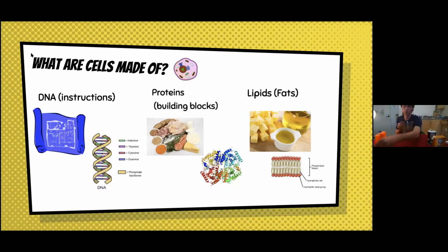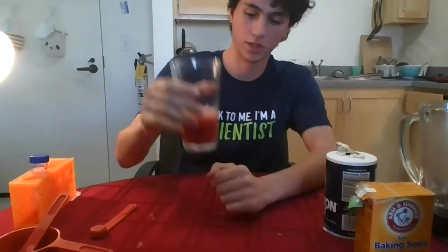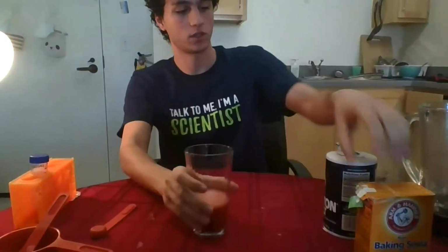So now I'm going to show you how it's supposed to look. Let's see, maybe we can stop sharing. Yep, perfect. So I think you can all see me. And here is, obviously, this looks very much like a strawberry smoothie. It's just water and the strawberry, and all the major structures of the strawberry have been destroyed and triturated, and so now we have this, and we can pour it. We can do as Gabriella was telling us.